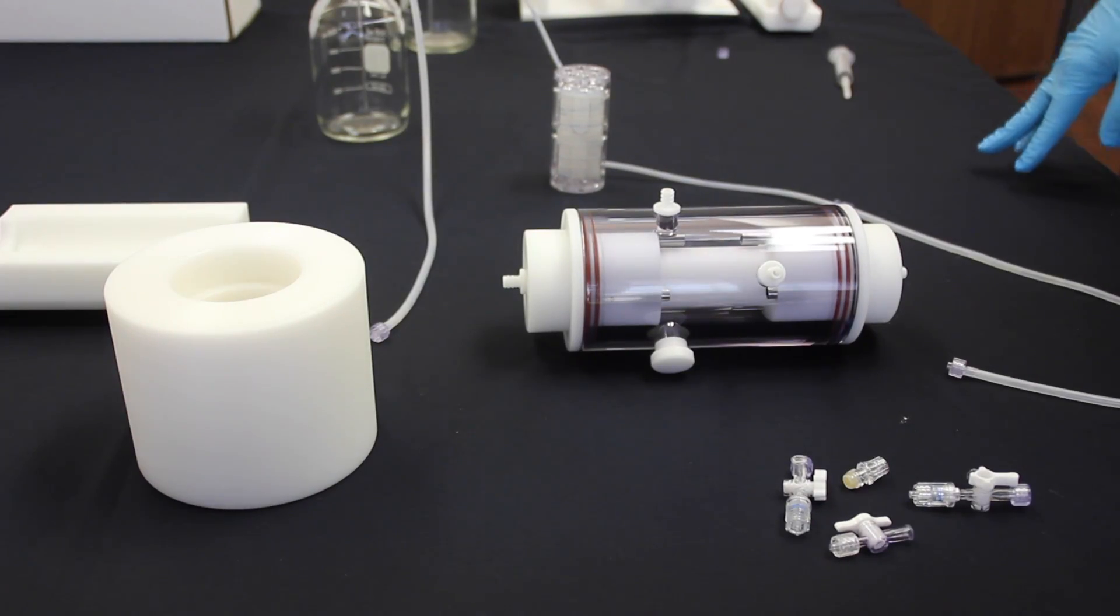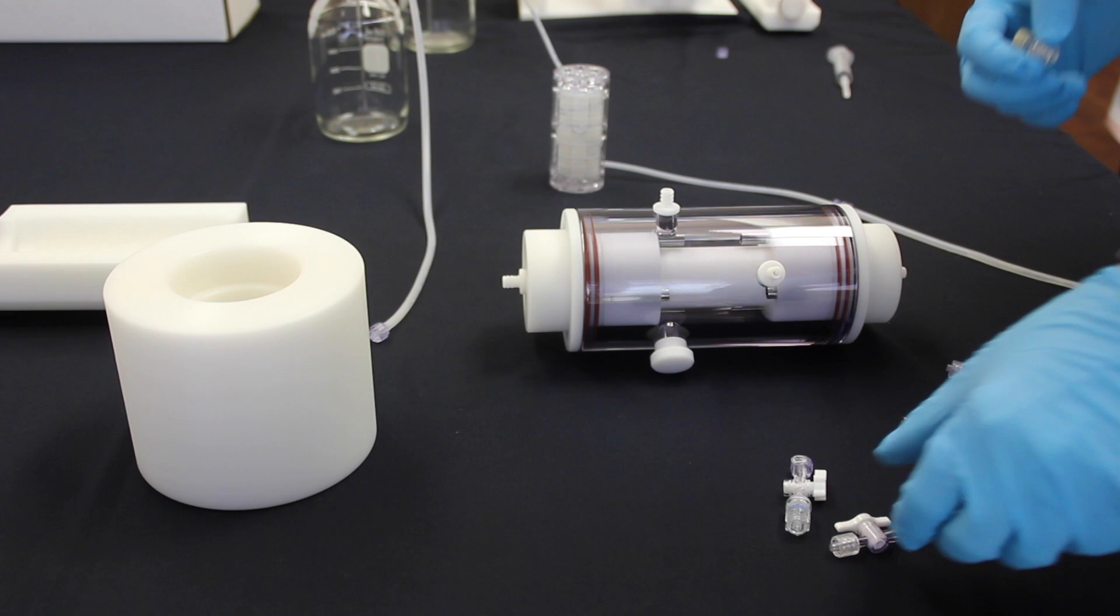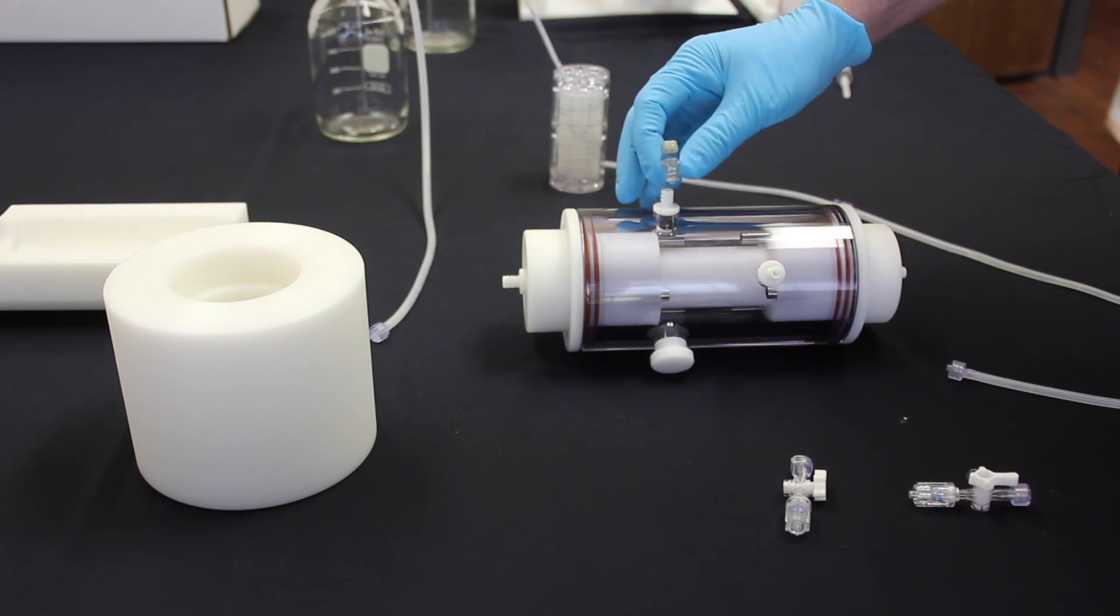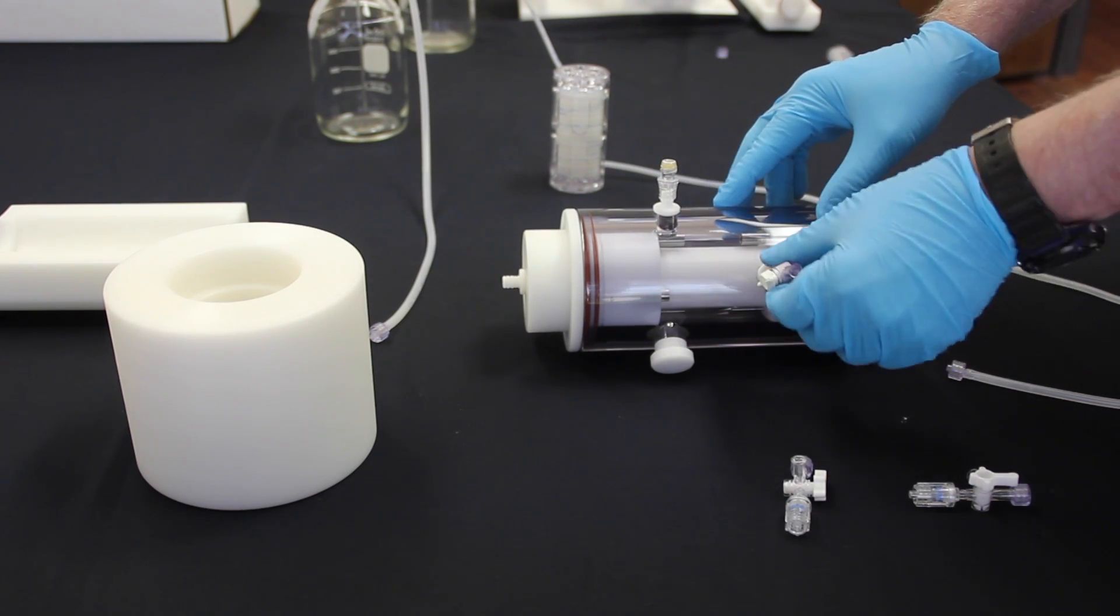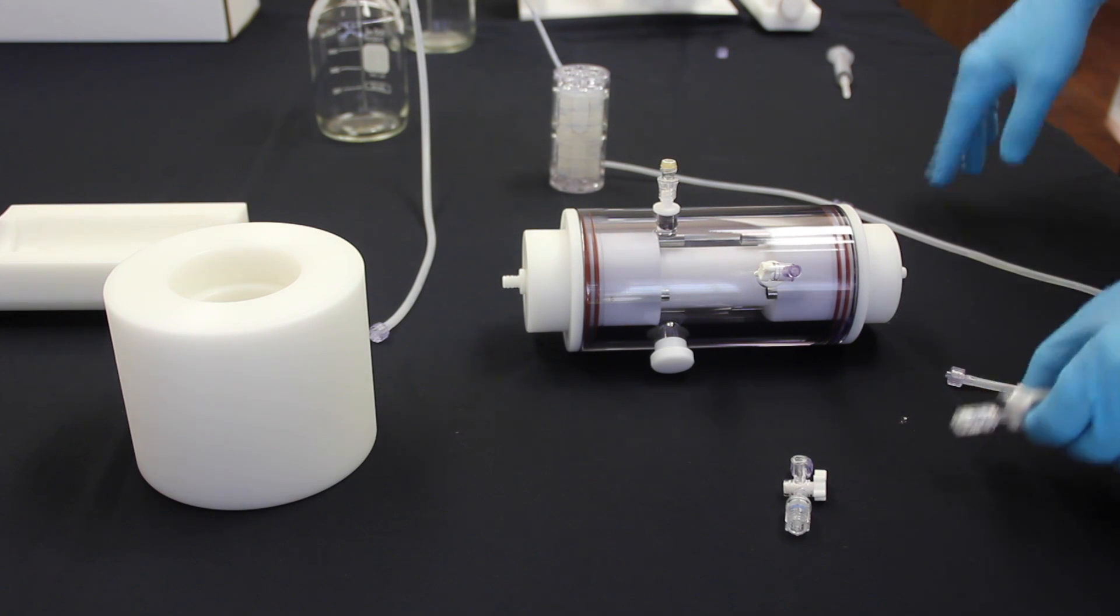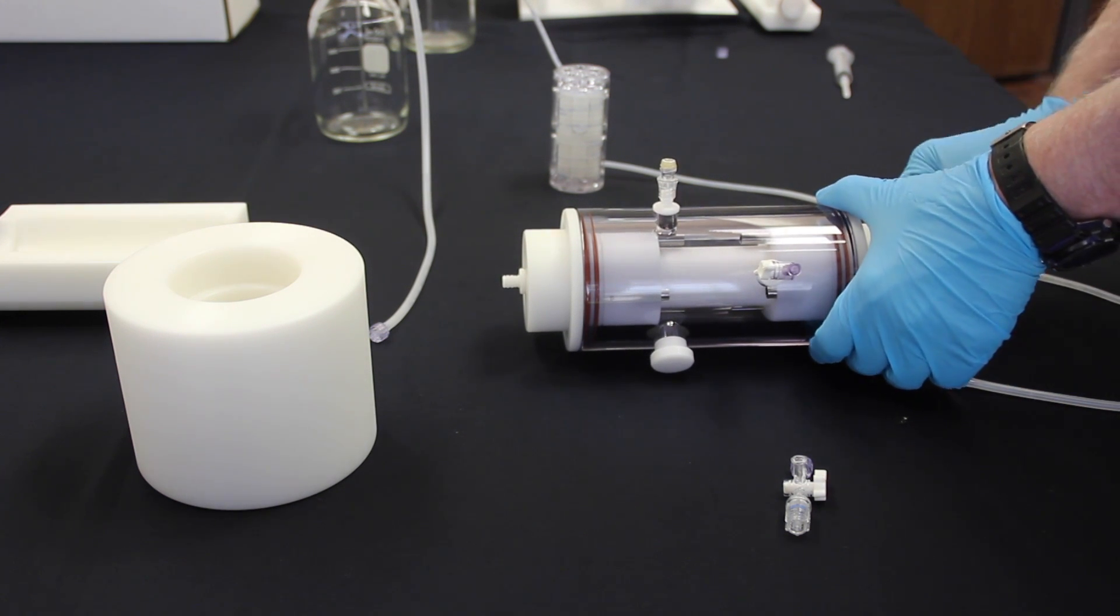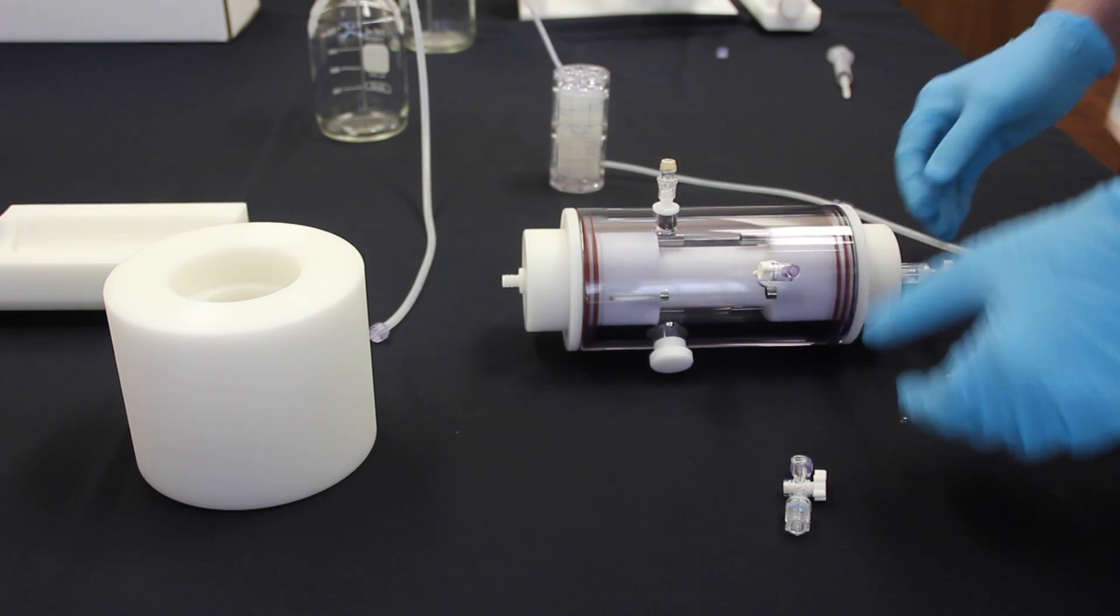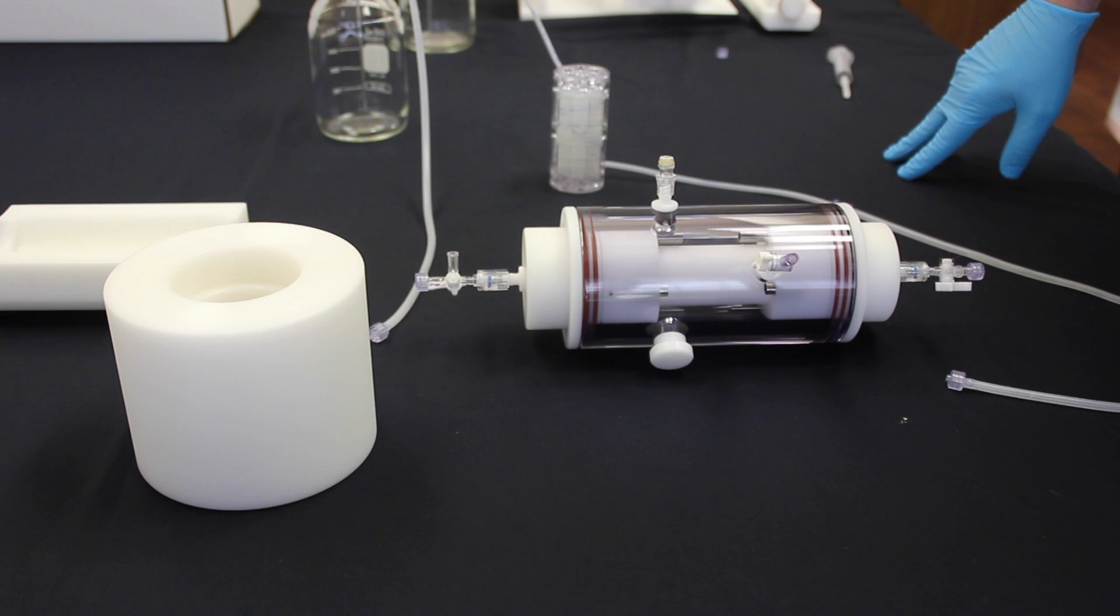So now that we have the vessel mostly assembled, you will need to remove the one-way valves or septums, whichever you choose to use, from their sterile packaging. Each of these will be attached to the ports one at a time before filling with media. Then on the sides, on the end caps, you will attach the other sterile one-way valves, keeping in mind which side is the inflow and the outflow.